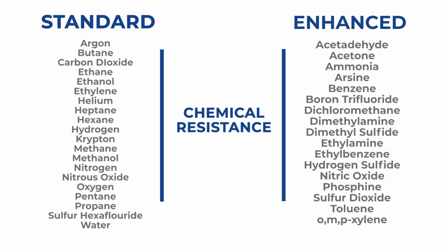A list of some of the gases and vapors that can be used in the standard 3Flex and enhanced chemical resistance model is displayed on the screen. Please inquire about any gases or vapors that are not on the list.